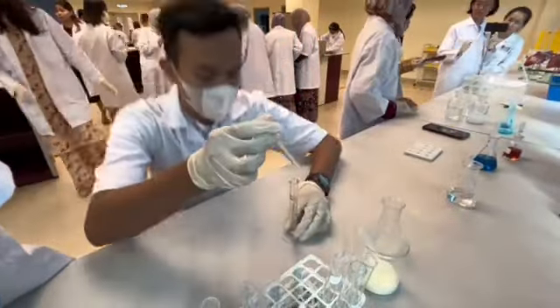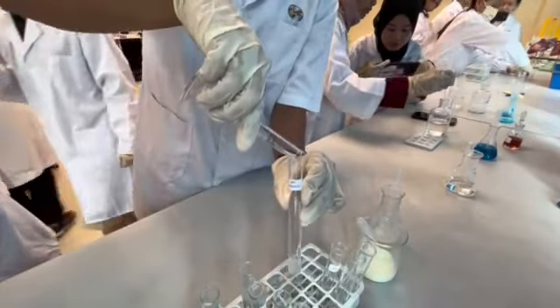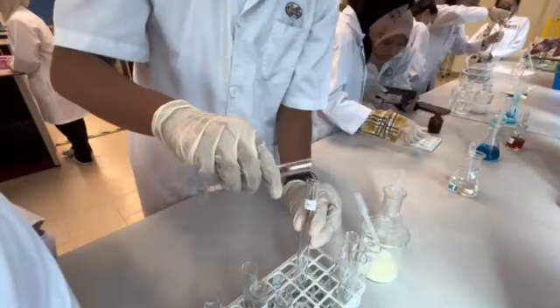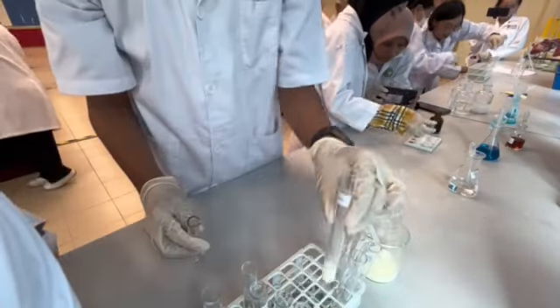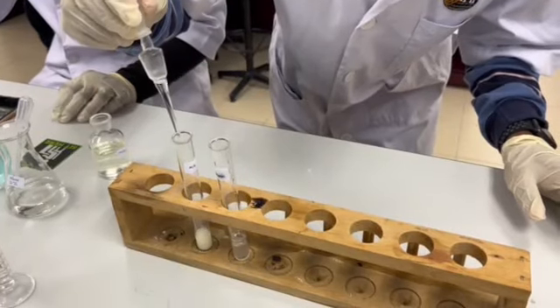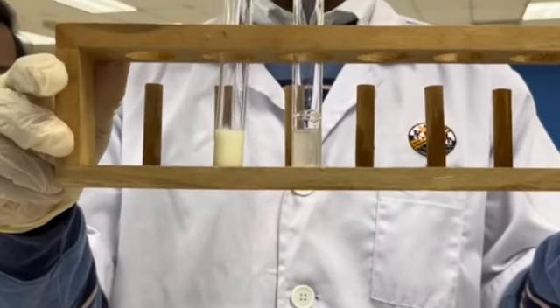Place 3 ml albumin solution 5% into a test tube. Then place 3 ml milk into another test tube. Next, add 3 drops of Millon's solution, then observe and record the result.